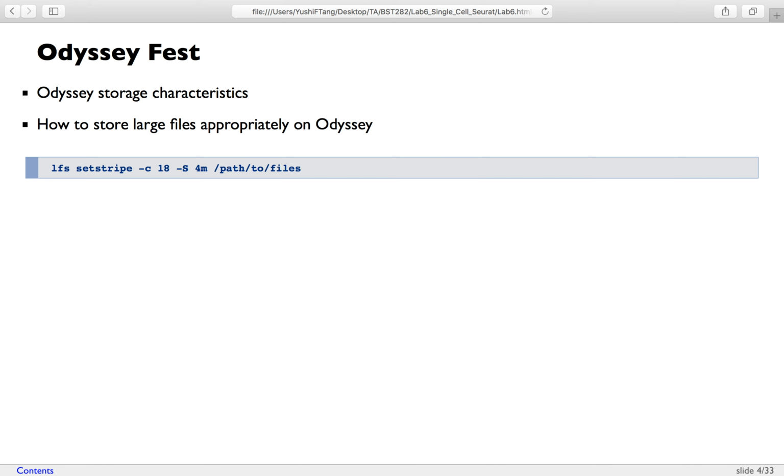So for this Odyssey tip, the problem we have to touch on now is that when you are doing research, especially when you are dealing with really bulky data, you might encounter large scale data while having to run multiple jobs on the same data set. For example, you might store 24 chromosomes' information in one large data set, and you have to run analysis for each chromosome separately.